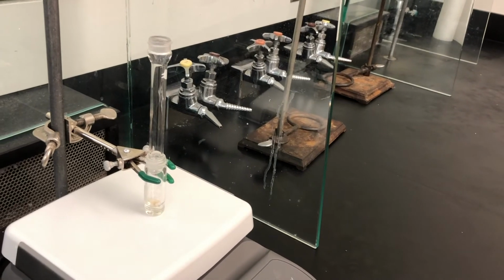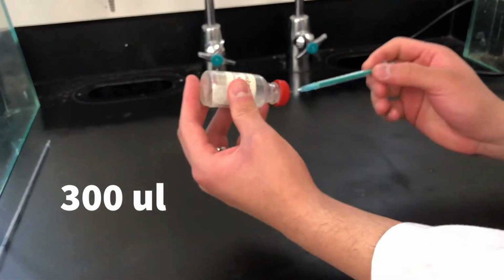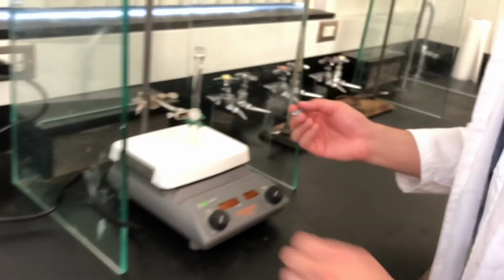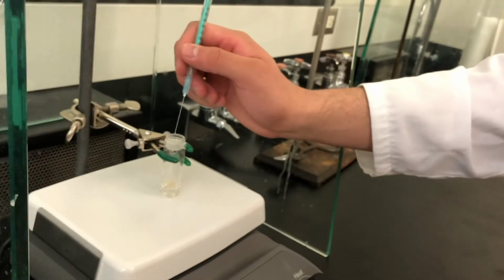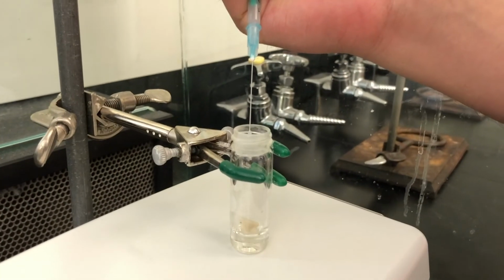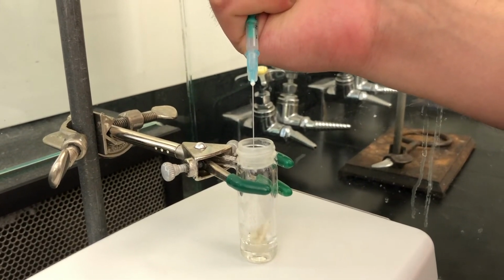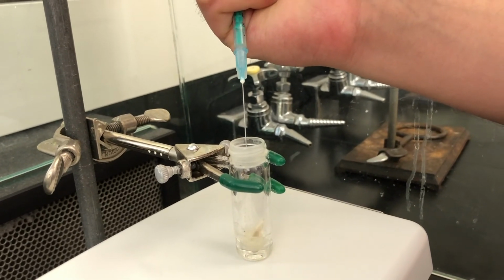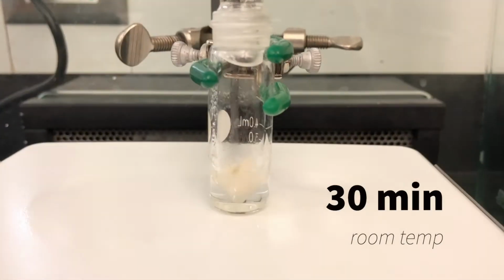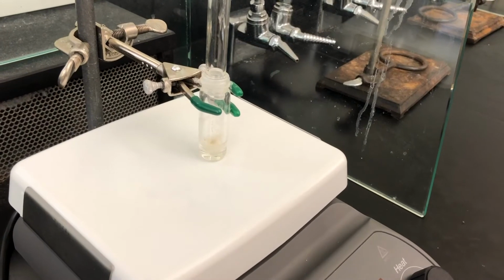Now we're going to add the 300 microliters of the sodium borohydride reducing agent. We're going to add it dropwise while spinning. And now we're going to wait 30 to 90 minutes. Okay, so it's been 30 minutes.